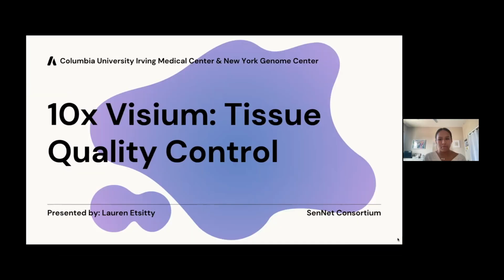Hello everyone and welcome. My name is Lauren Etsitty and today I'll be giving a presentation about the 10x Visium tissue quality control procedure conducted at my summer internship held by NIH at the Columbia University Irving Medical Center and the New York Genome Center.